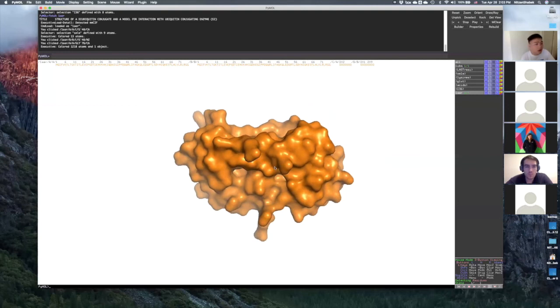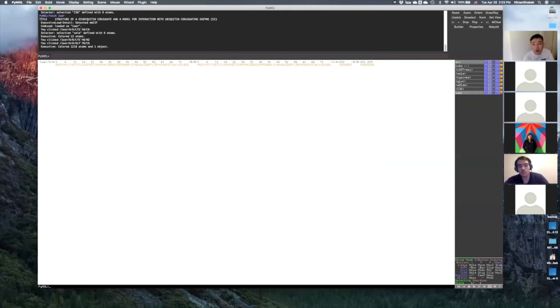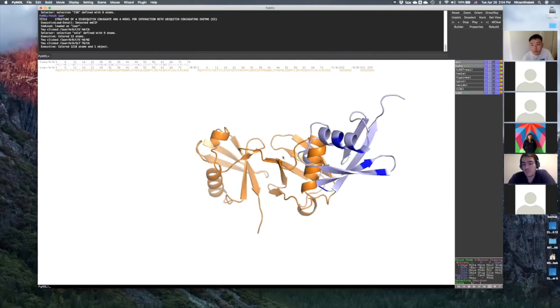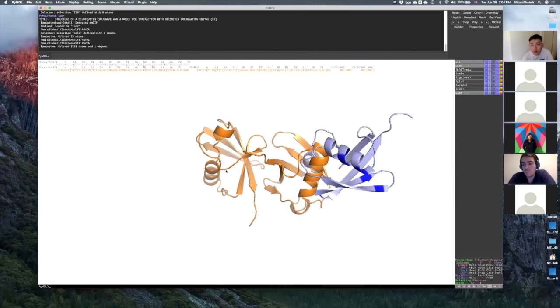Last for this session today, I want you to hide everything. And I want you to show cartoon only, and you can use all. So all is basically, you can show all cartoon. So we basically do cartoon and highlight the one UBQ. So you will see it like that.